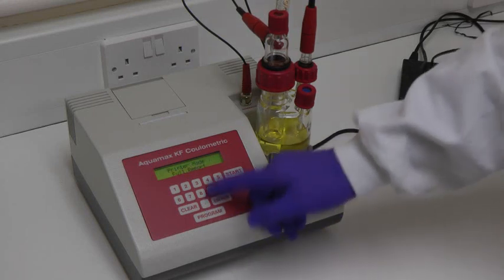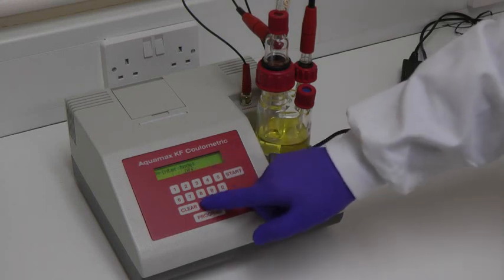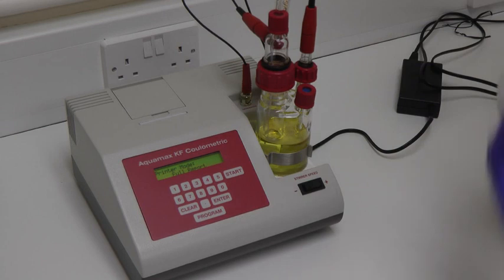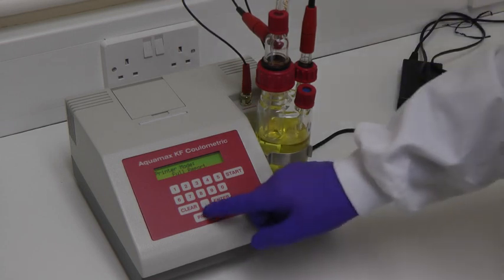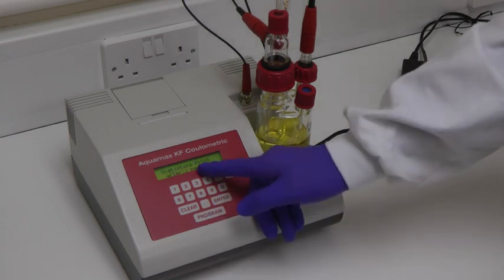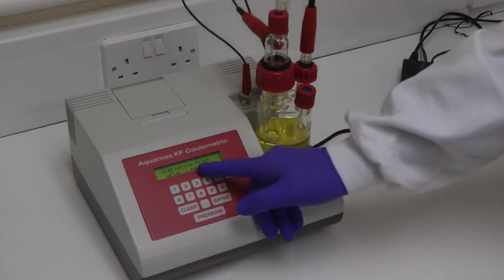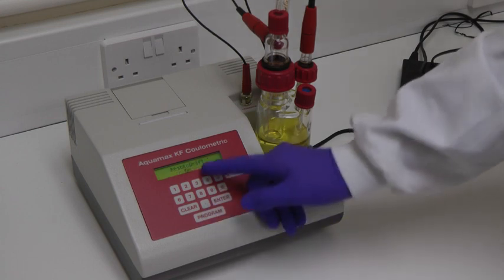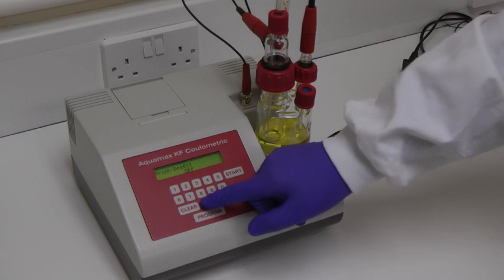The Printer Mode parameter gives options for Off, for printing every result, or for a full report including time, date, sample number, instrument serial number, and so forth. The Statistics Print parameter will print statistical data from a series of up to 99 results. The Background Drift Print option may be either on or off.